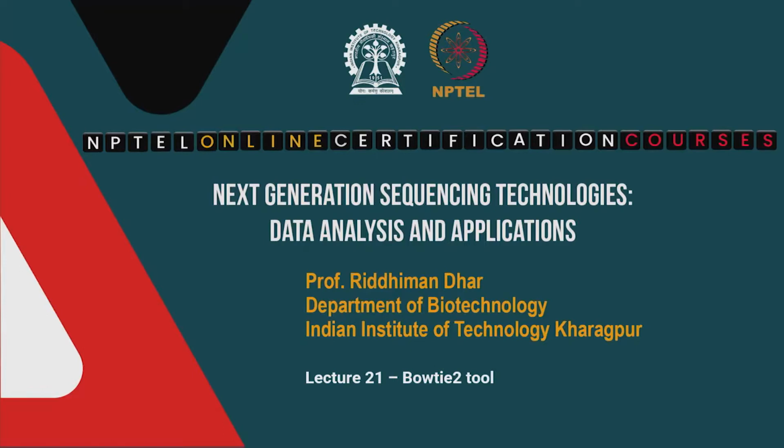Good day everyone, welcome to the course on next generation sequencing technology, data analysis and applications. In the last few classes we have discussed several mapping algorithms, and in the last class we looked at BWT based mapping. We have seen that this is probably the ideal method for us because it is fast, it does not take too much memory, and it can handle all sorts of reads. It can handle reads with mismatches, and it can also map reads to multiple positions or mapping to repeat sequences.